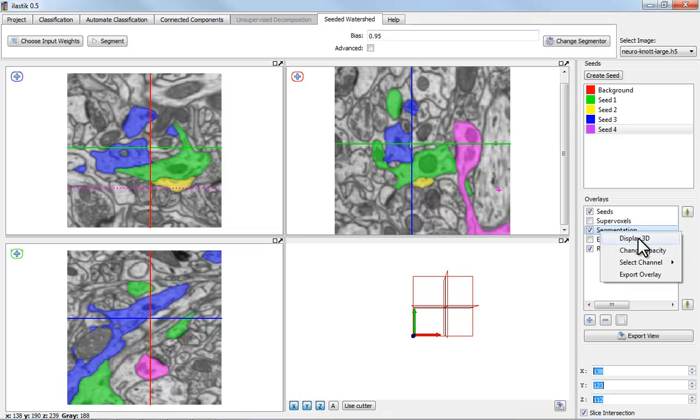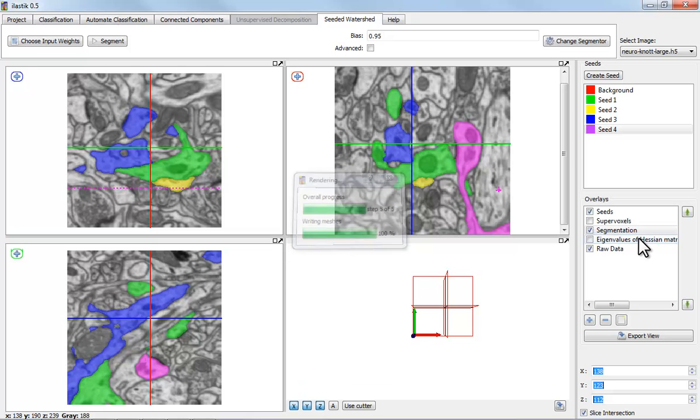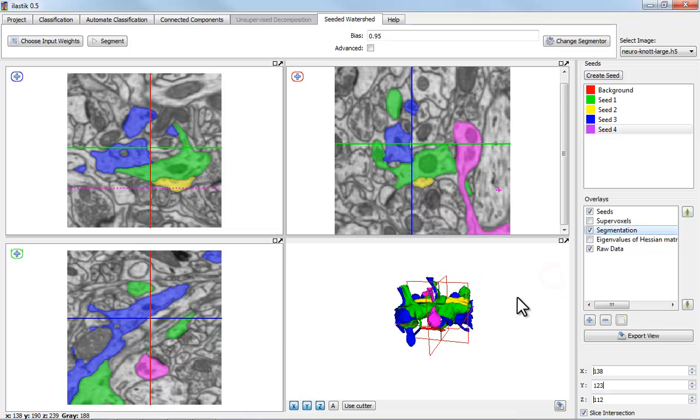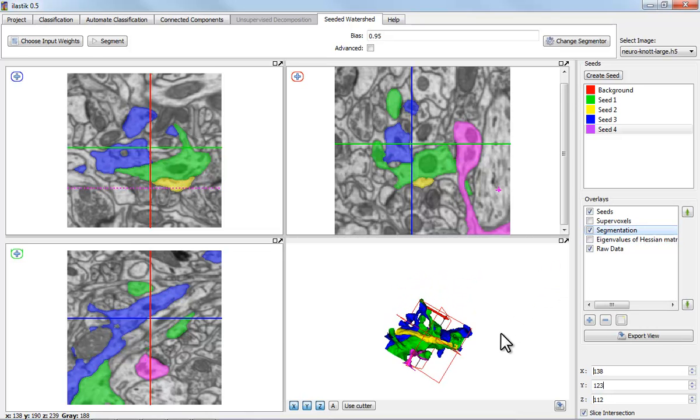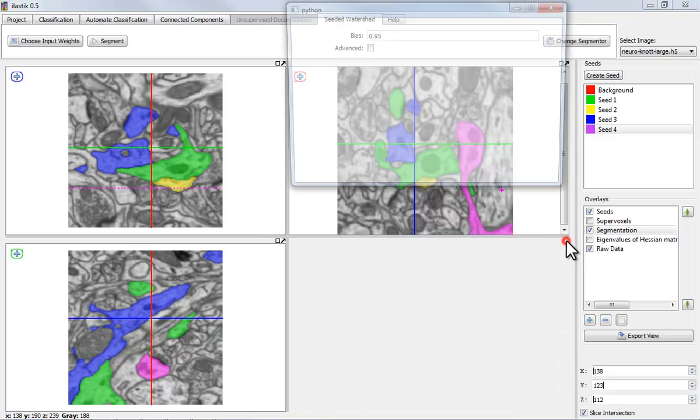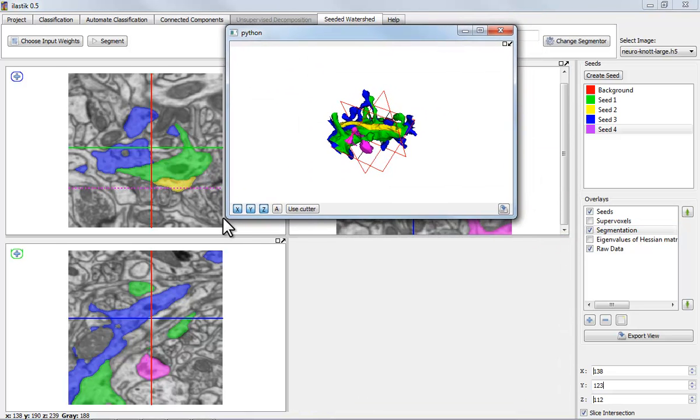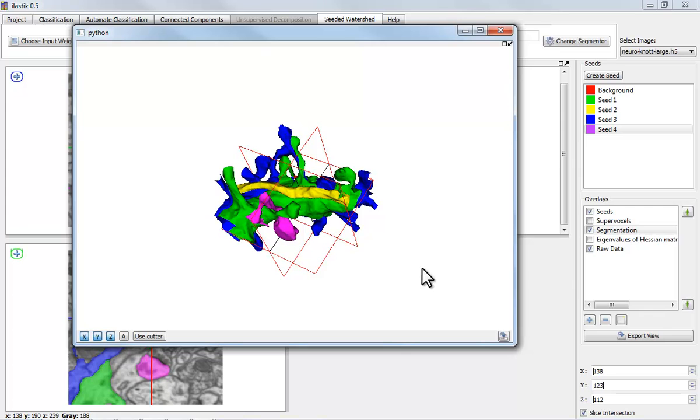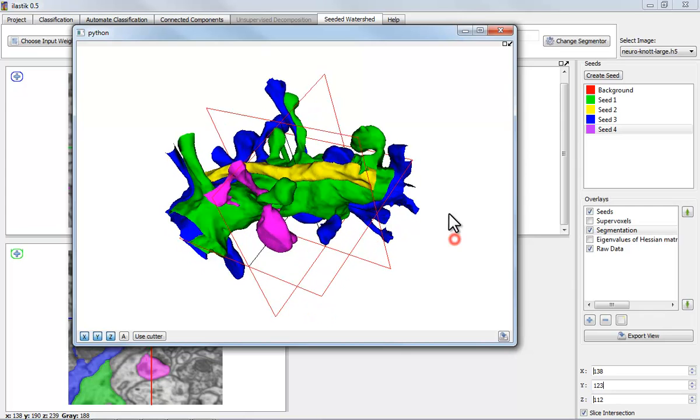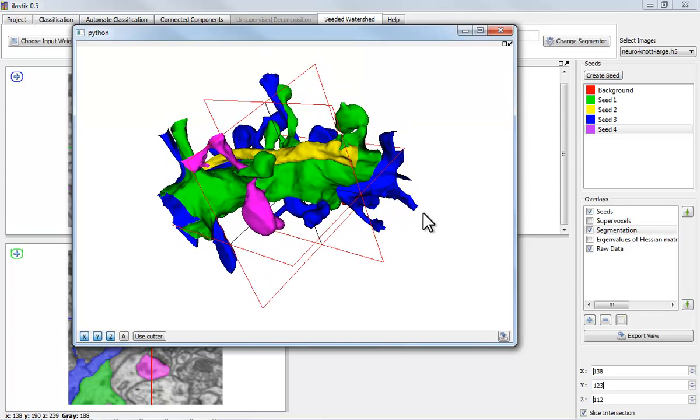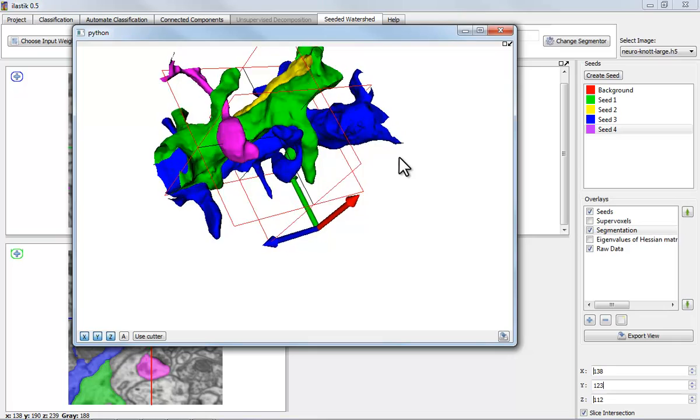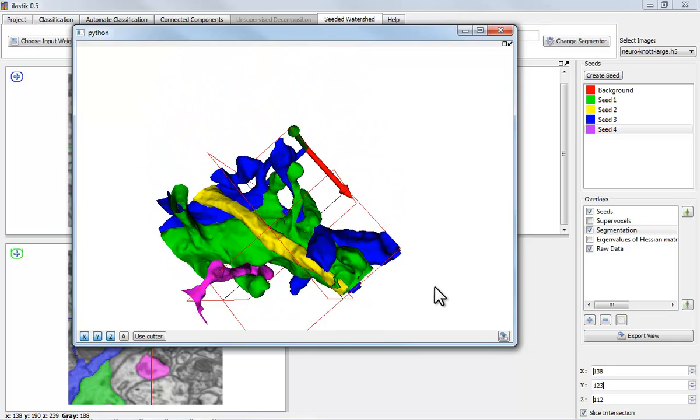And to look at this in 3D, I can render isocontours of all of these segments. So, here we go. And indeed we see the boutons of the green structure here.